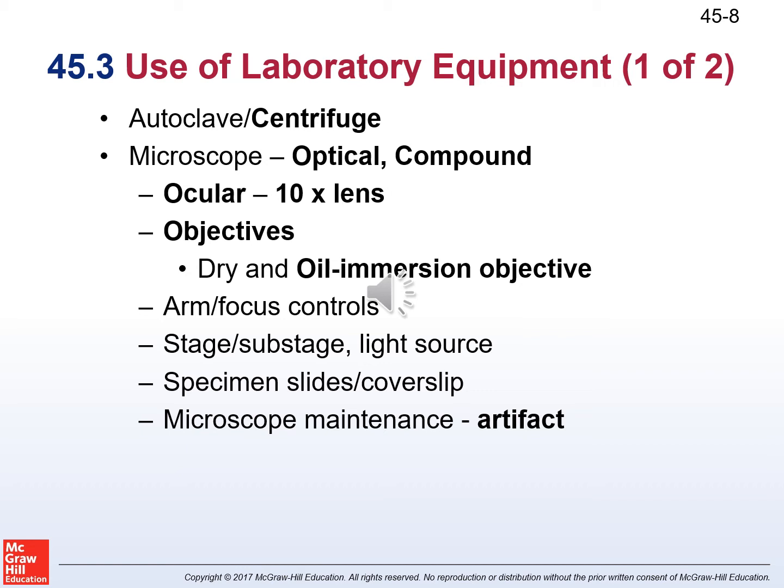The specimen slide is not technically part of the microscope, but the equipment cannot be used without it, because all specimens must be placed on a slide. Many slides will require a cover slip to support and position the specimen. A cover slip will also keep the specimen from being contaminated. The microscope must be kept clean and carefully stored to prevent contamination by artifacts or foreign objects visible through the microscope, such as skin, oil, dust, and eye makeup.